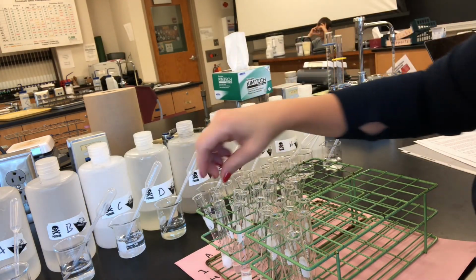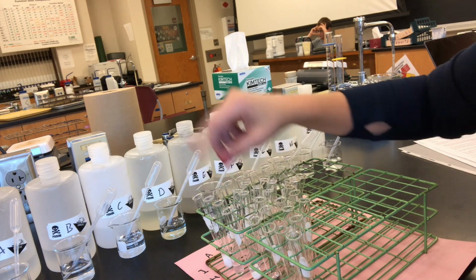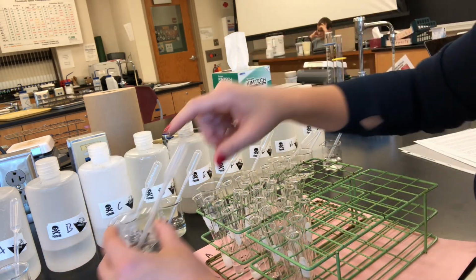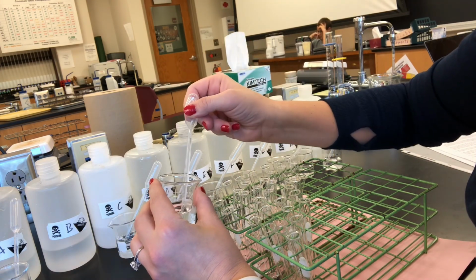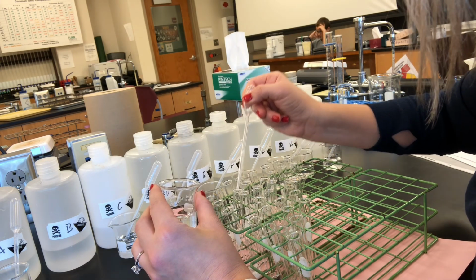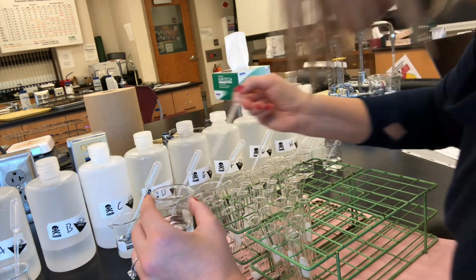So I'm going to do the same thing now, where I'm going to this next row, I'm going to take B and put B down that next row, and then we'll run through the same process again. So about a half a milliliter of B to each one. I feel like that didn't get a fair amount.